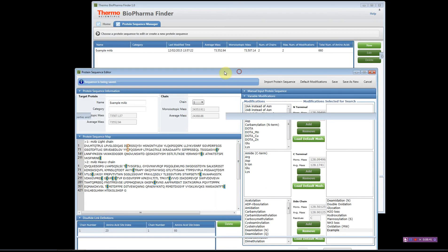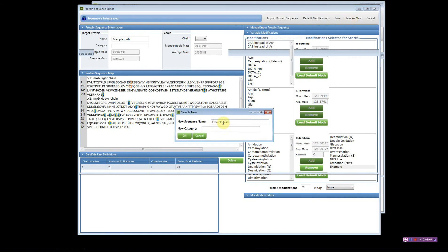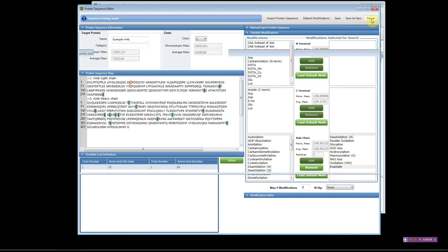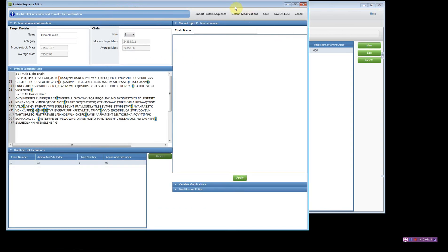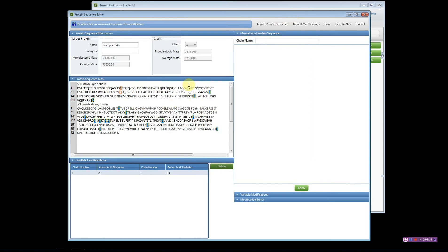Now that we've entered this information, we can save — and scrolling down, the protein sequence will automatically be added to the Protein Sequence Manager. You can also use Save As to give it a custom name different from what was in the FASTA file. Close using the red X button, and you can see your protein sequence in the manager. To edit an existing entry, highlight it, hit Edit, and the information will pop back up.